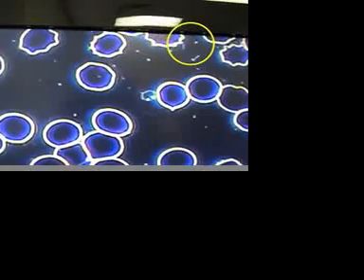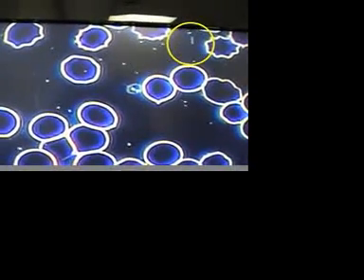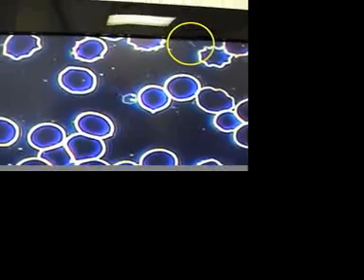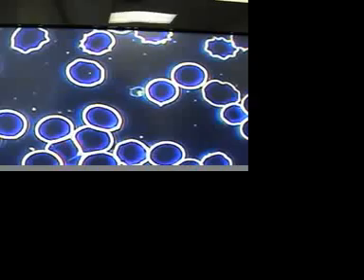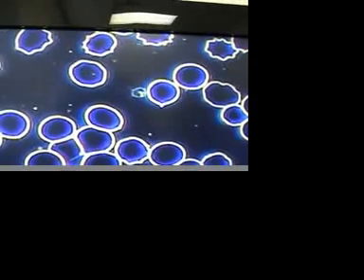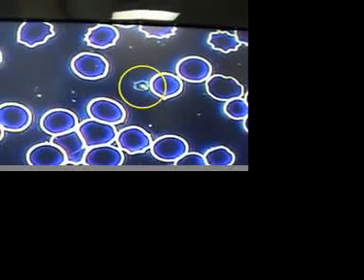This guy seems to be going somewhere. Here are two small Organism Xs that you'll see in a minute with the circle. Hard to say on these guys. They're small. They could be Organism Xs. They could just be broken pieces of cell wall.